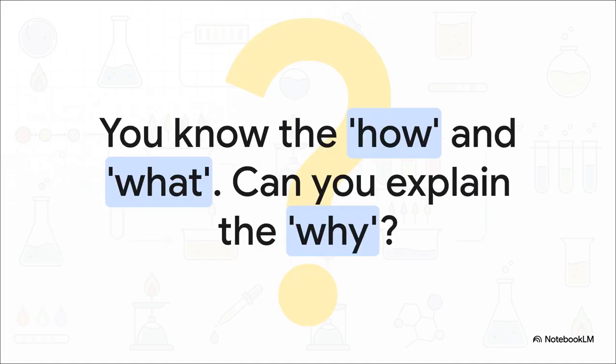So we'll leave you with this one last challenge. You now know the how, as in how to do all these tests. And you know the what, all the different results mean. But to really smash this and get the top grades, you need to know the why. Why, for example, do we use nitric acid for the halide test, but hydrochloric acid for the sulfate test? Pondering those why questions, that's what takes you from just knowing the facts to truly understanding the chemistry.